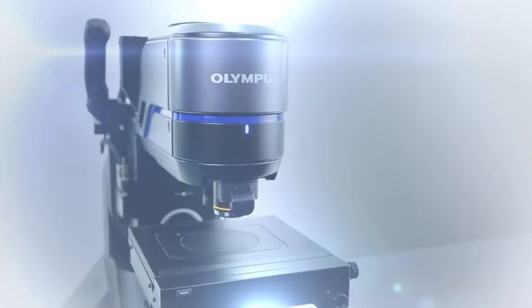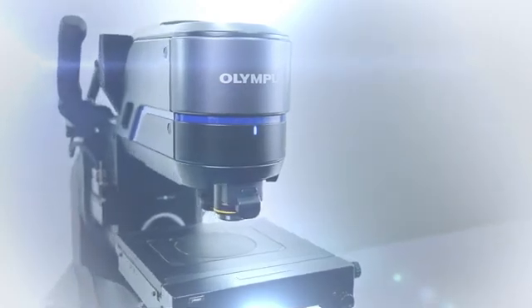The DSX-1000 All-in-One Digital Microscope is the tool of choice for inspection and failure analysis. With speed, flexibility, guaranteed accuracy and repeatability, and high-performance imaging software, you can be confident in your results.